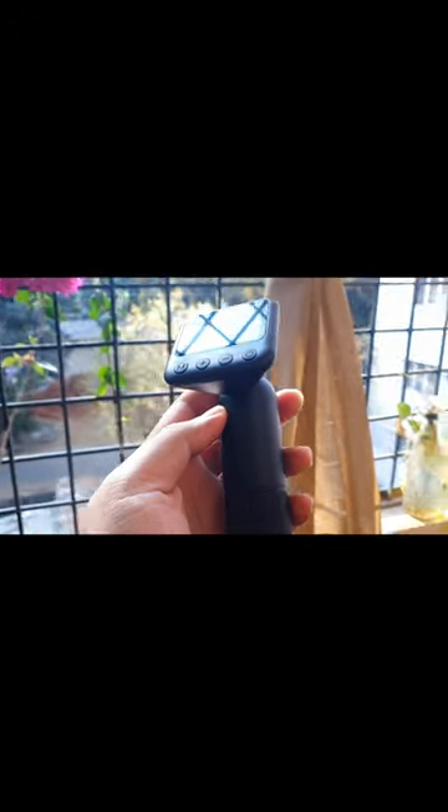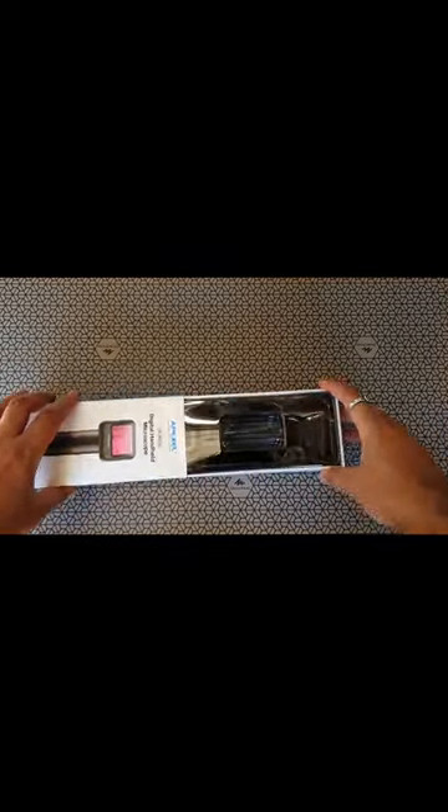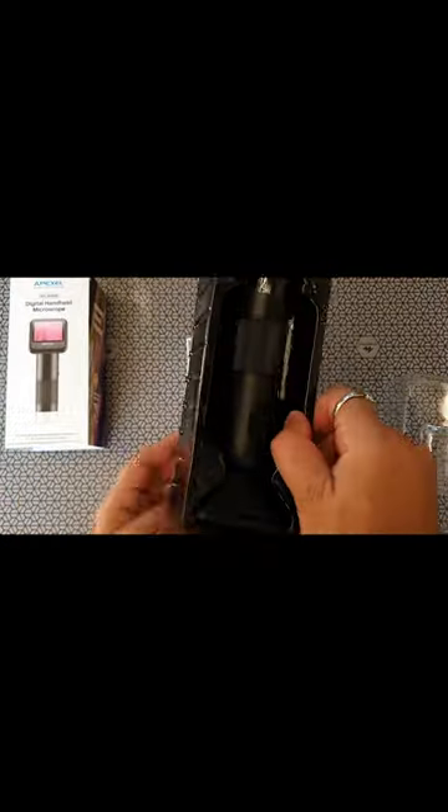Hey, welcome back. This is the Apex cell digital handheld microscope. This can measure items up to three microns. The device is rechargeable, has a built-in battery of about 700 milliamps, which means it can run for about two to two and a half hours. It's got a nice 320 by 320 IPS display, built-in LED, and about 400 lumen brightness for any of your subjects.